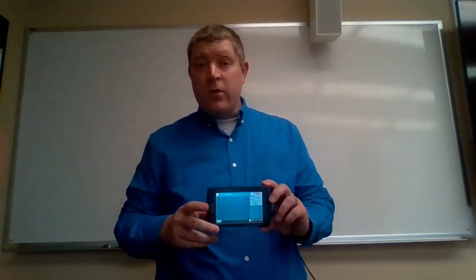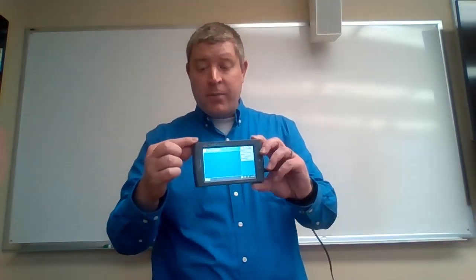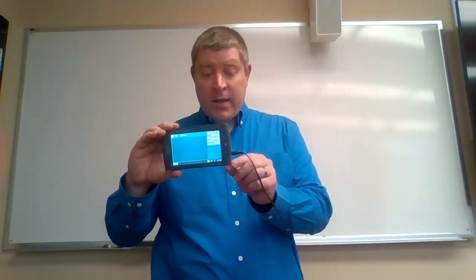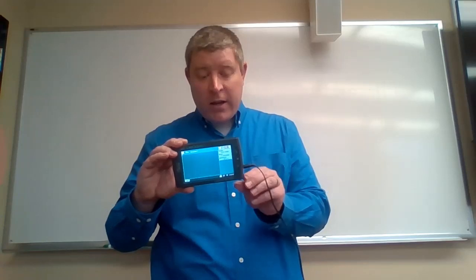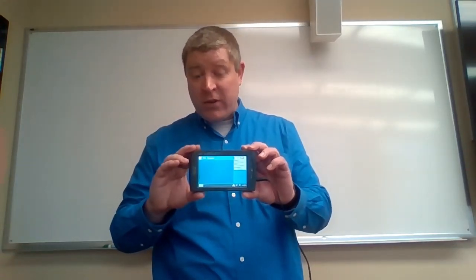We are also going to use a digital device to collect data for us, the LabQuest. So the LabQuest has a power button on the top left here. It has a power adapter that plugs in on the right side. Behind that is a stylus that you can use to touch various places on the screen. If you're like me and have larger fingers, it can be very difficult to touch accurately and push the buttons without fat fingering and pushing somewhere else.